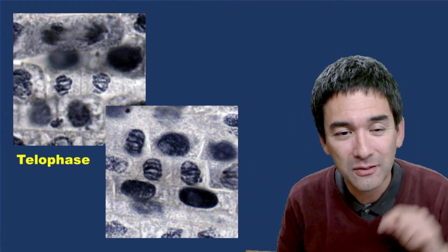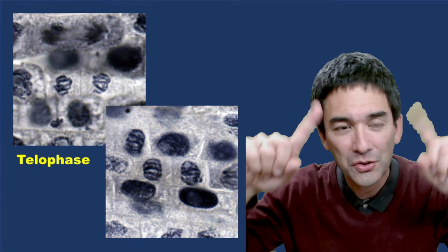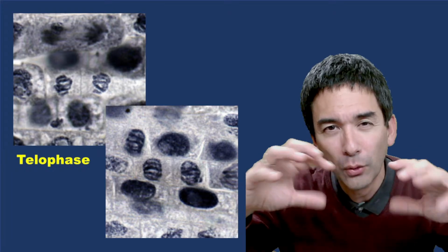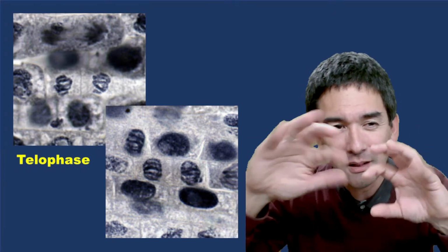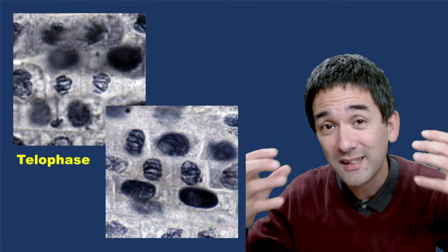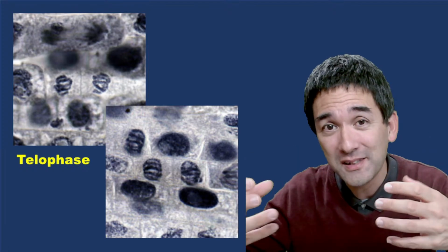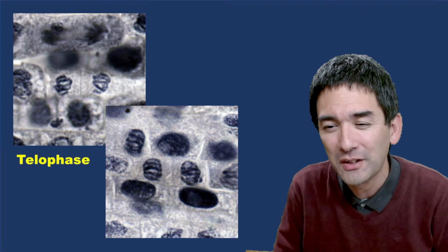Those nuclei that you see over here in the center, or also in the top picture, look a little bit like prophase because you can still see the chromosomes there, in a slightly disorderly manner. That's correct in the sense that telophase is the reversal of prophase, so the chromosomes slowly start to form loose DNA again.